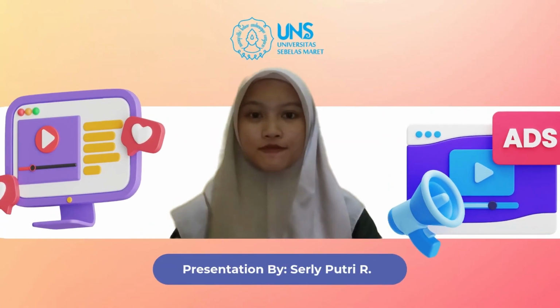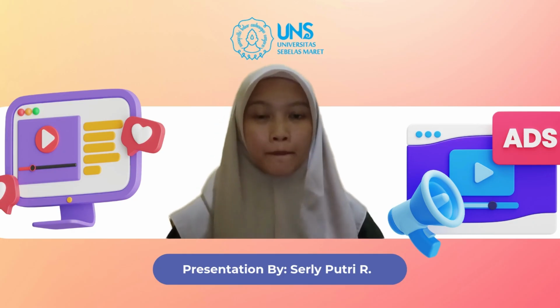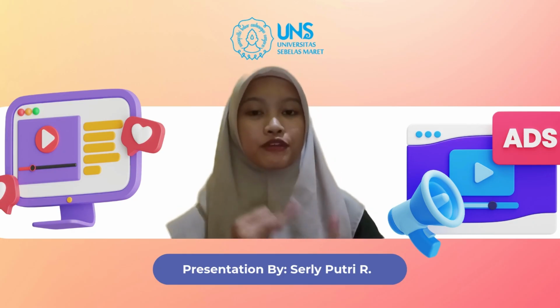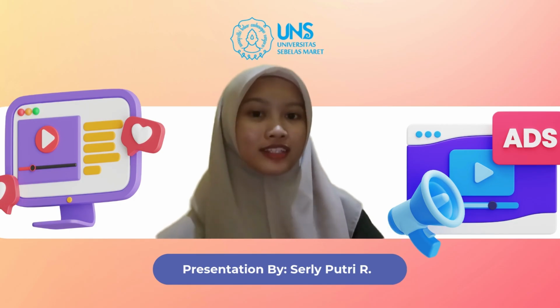Hello everyone, in this video, I will give a tutorial on how to plot data in OriginLab for XRD, UV-DRS, SEM, and also FTIR characterization.